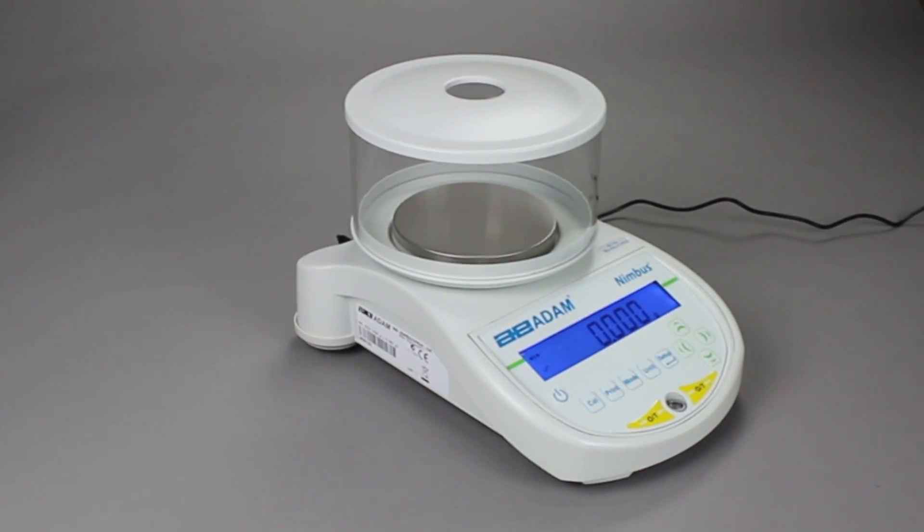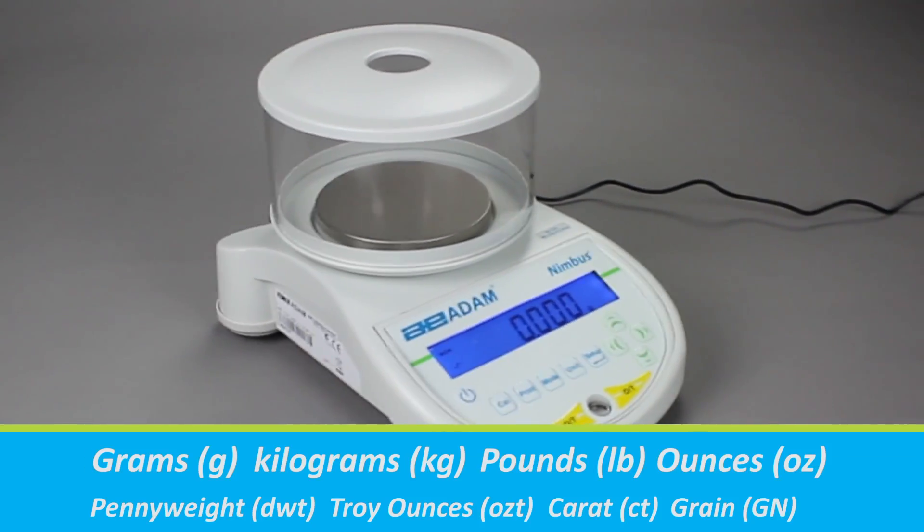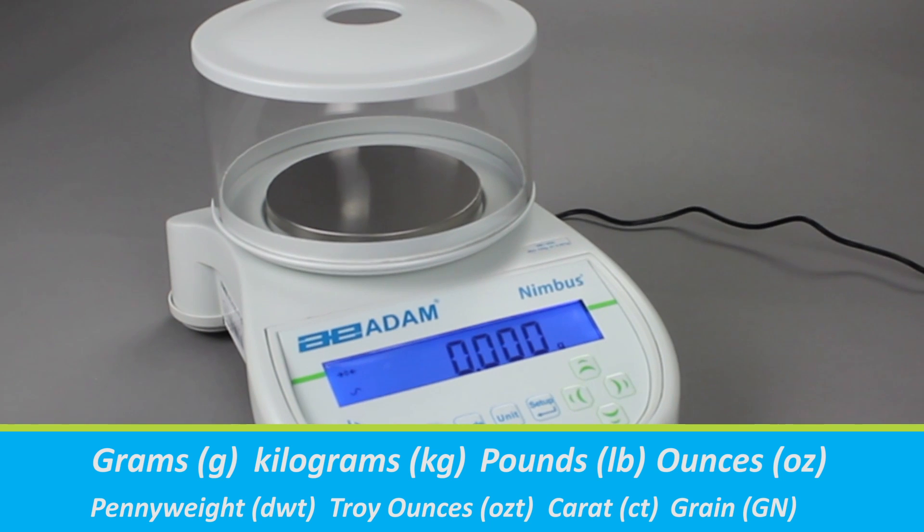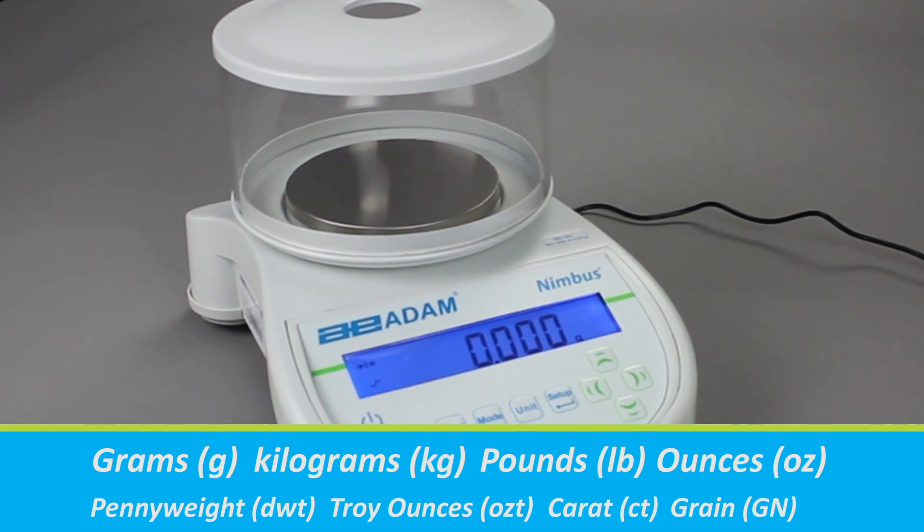Nimbus balances can display results in several different weighing units, depending on your needs. You can disable unwanted weighing units to avoid weight-reading errors.